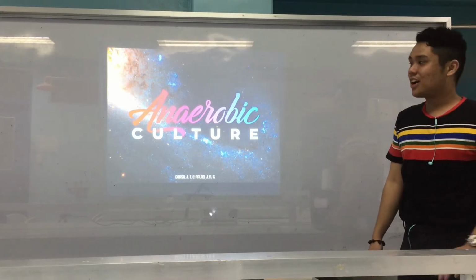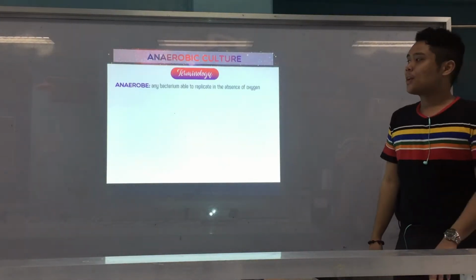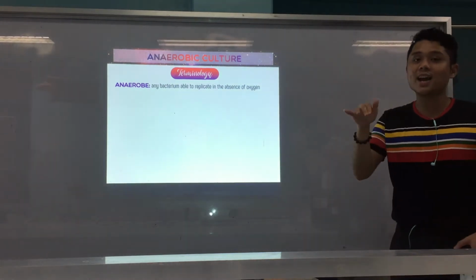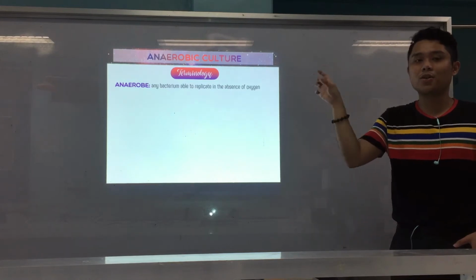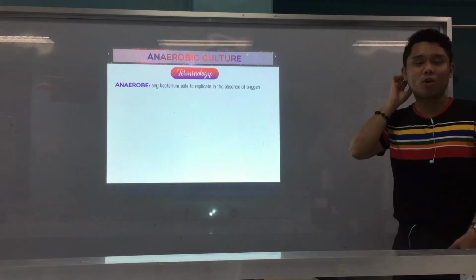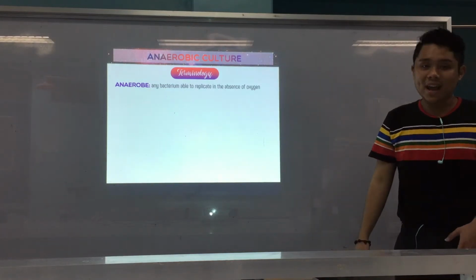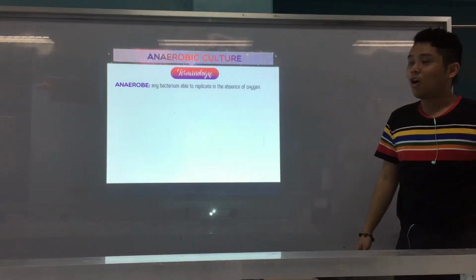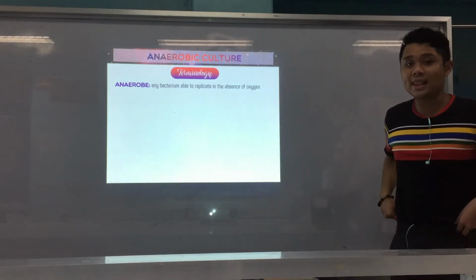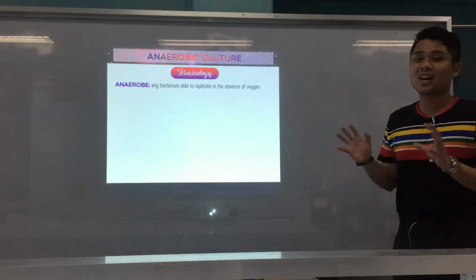Okay. So again, some terminologies. We'll start first with, of course, anaerobe. By the name itself, anaerobe, without aerobe. An organism that does not replicate or does not live well in the presence of oxygen, or it lives and replicates well in the absence of oxygen. The point is that it does not need oxygen.